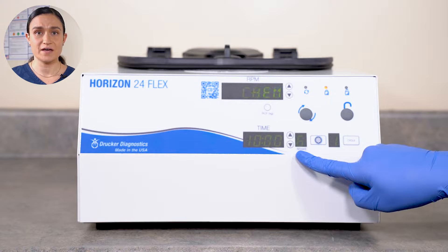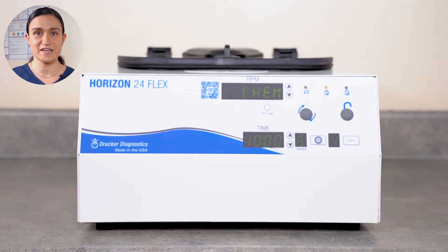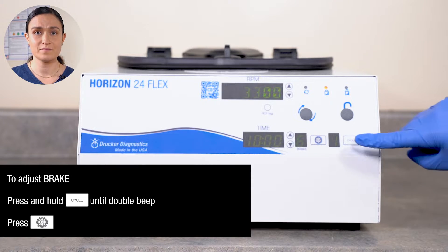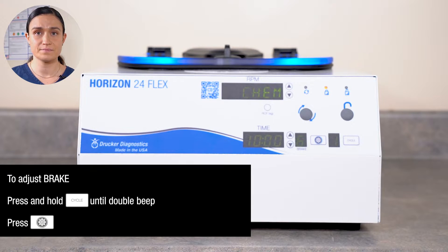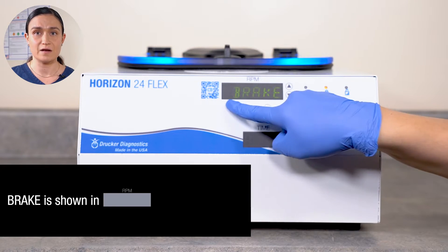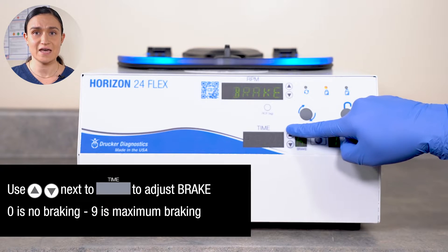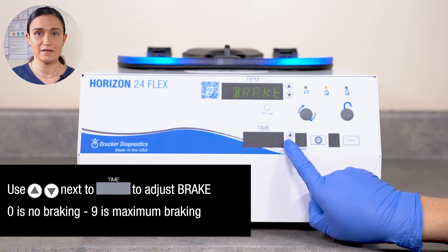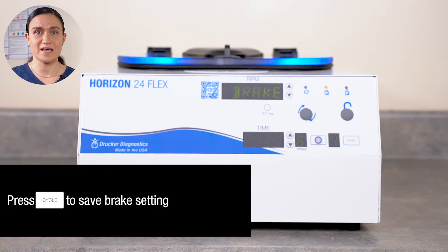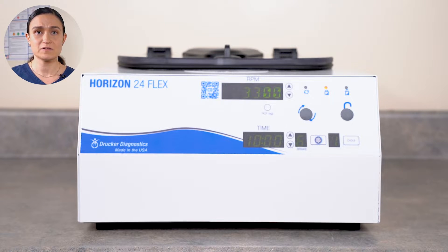The brake setting controls whether or not a brake will be applied as the centrifuge slows down at the end of each cycle. Brake can be set from 0, no braking at all, to 9, maximum braking. To adjust braking, press and hold the Cycle button until you hear a double beep. Then press the Menu button to enter the advanced menu. Brake should be displayed in the RPM screen. Use the Up and Down arrows next to the Time screen to adjust the brake setting. Once your brake setting is as desired, press the Cycle button to exit the menu. The centrifuge will run with the selected brake setting until you change it, or until you load a saved setting with a different brake setting.